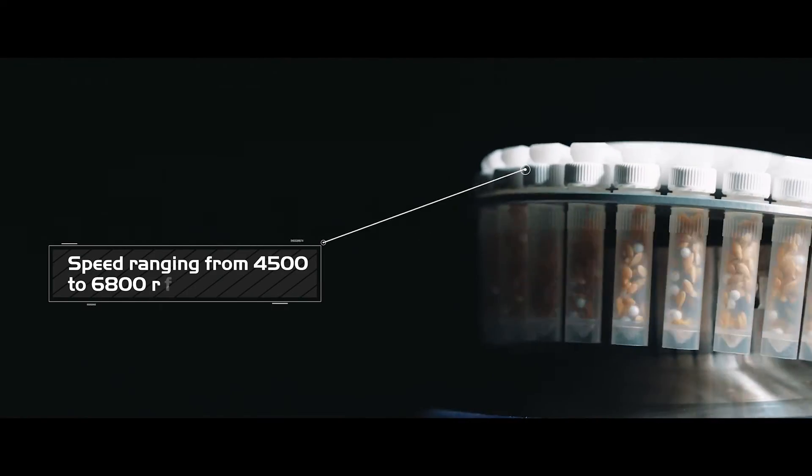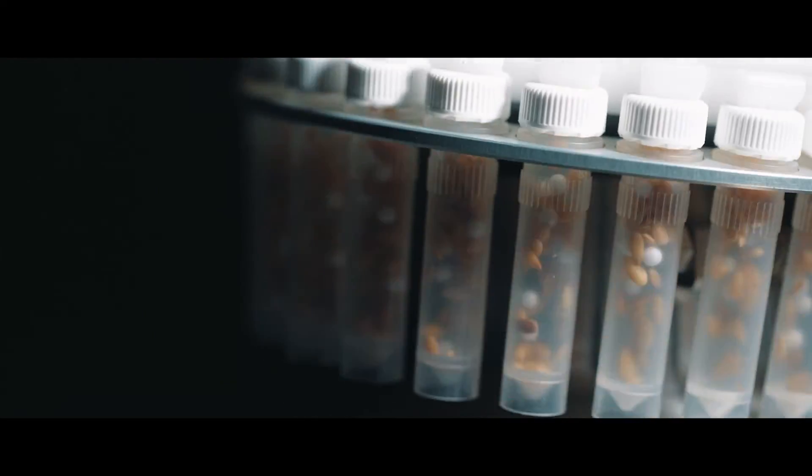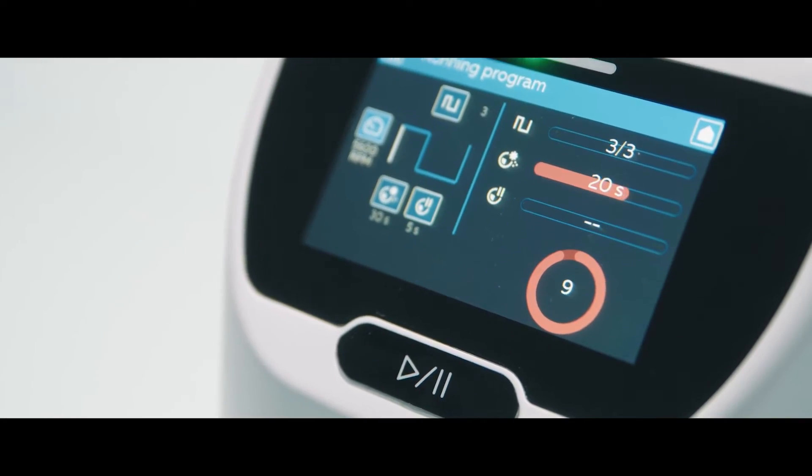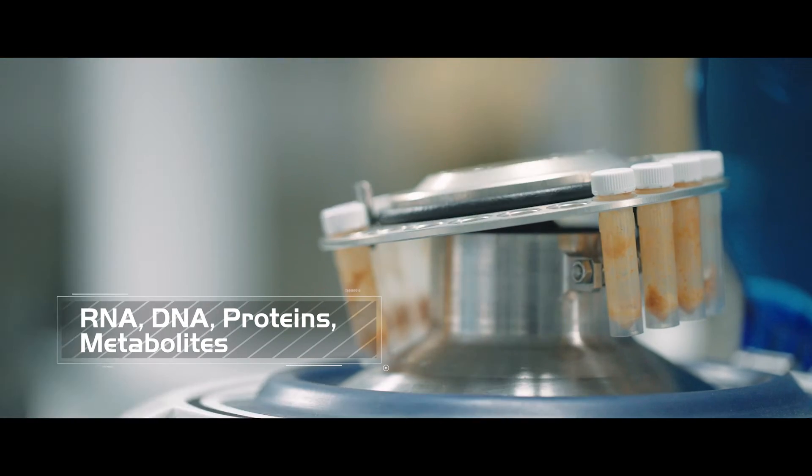The high performance of Precelas 24 Touch allows you to grind your sample in less than five minutes. Its 3D bead beating technology allows optimal extraction of RNA, DNA, proteins or metabolites from biological samples.